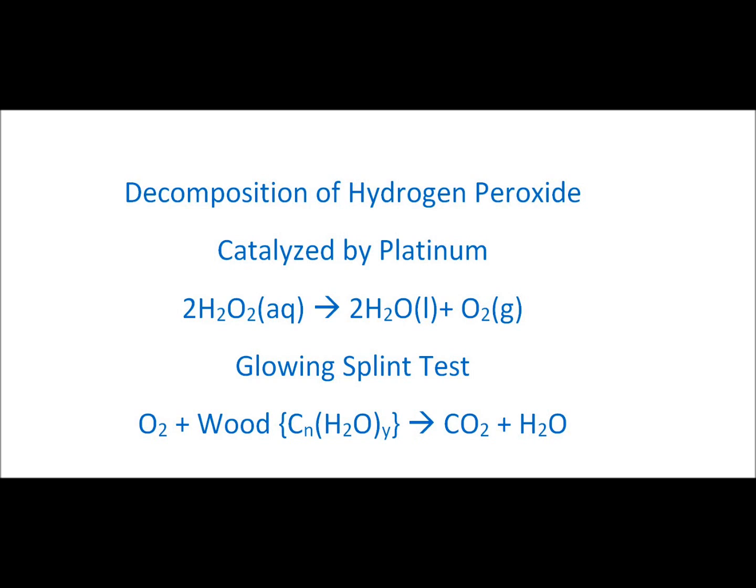I'm going to then do the glowing splint test on the oxygen. I'm going to take a wooden splint, ignite it, blow out the flame, and then introduce the glowing splint into the cylinder, and the oxygen will cause the wood to burst into flames.